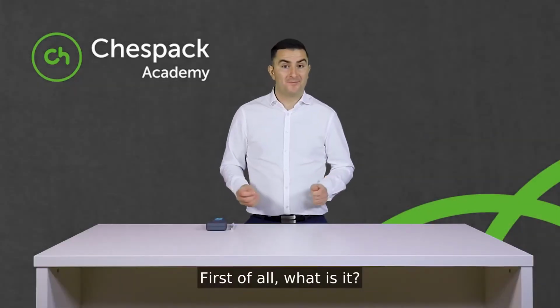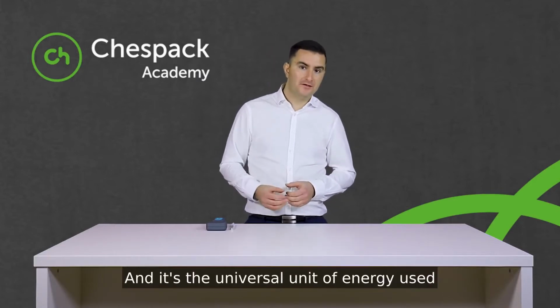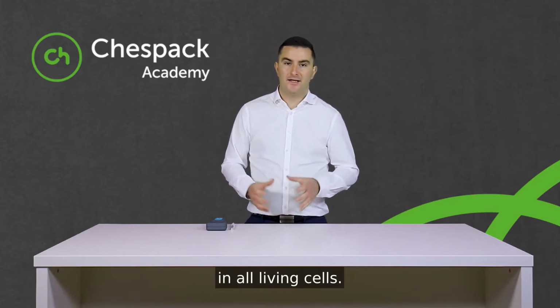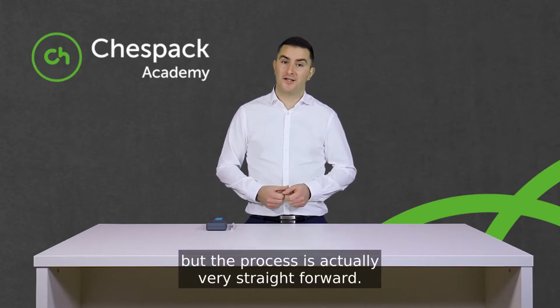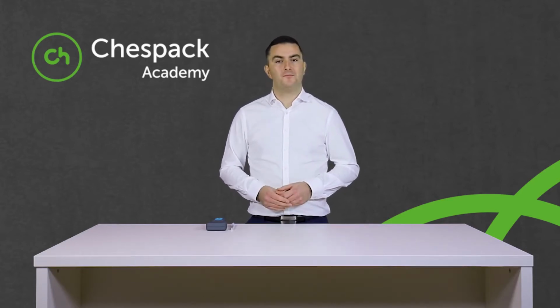First of all, what is it? ATP is present on all organic material, and it's the universal unit of energy used in all living cells. It may sound pretty complex, but the process is actually very straightforward. Let's move on and find out a little bit more about it.